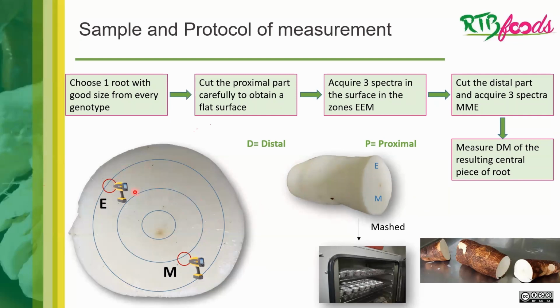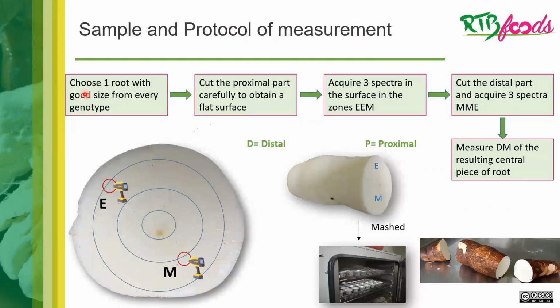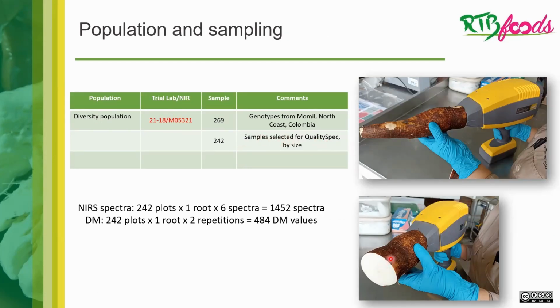Then the idea is to take the spectra in these zones. The population that we used this year was a diversity population. This population had 269 genotypes. This is coming from Momil, North Coast, from Colombia. But we selected only 242 samples for the quality spec because we need a good size to obtain good spectra in the proximal and distal area. Then we used 242 plots, one root per genotype or per plot.